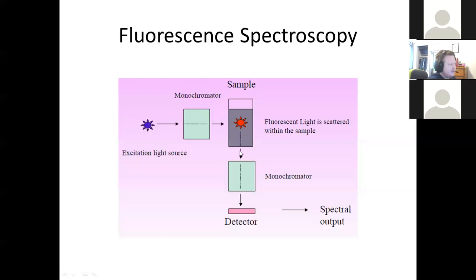But essentially, by going like this, fluorescence can happen in any direction, not just along the beam path, like where we're looking for the difference between these two. So we typically do a 90-degree measurement here, and we look for specifically just a specific wavelength fluorescing. So we have to have another monochromator to get rid of all the other light that's scattering and/or fluorescing. Potentially there are other fluorescent transitions as well. And we're detecting just that fluorescent wavelength at the detector, right? Okay, so this is an emission process.